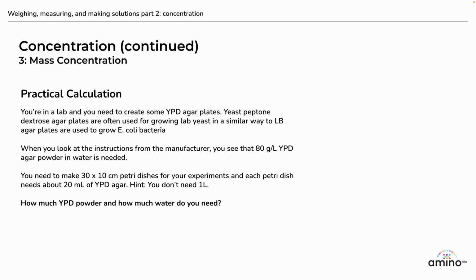All right, so this practical calculation is you're in a lab and you need to create some YPD agar plates. Yeast peptone dextrose agar plates are often used for growing lab yeast in a similar way to LB agar plates that are used to grow E. coli bacteria, right? So it's just another kind of growth media plate, YPD.